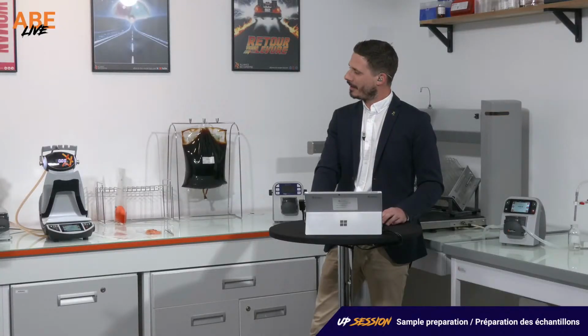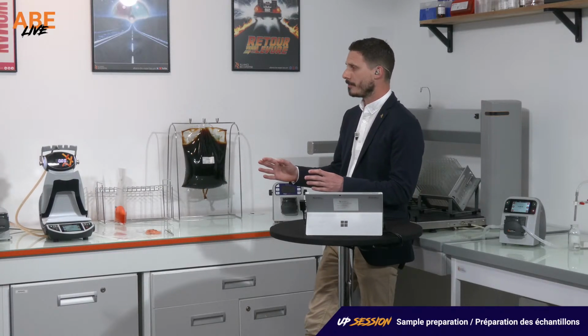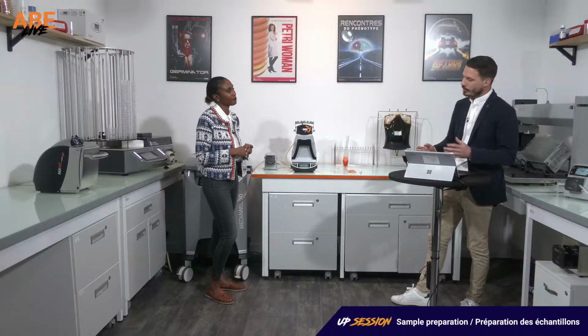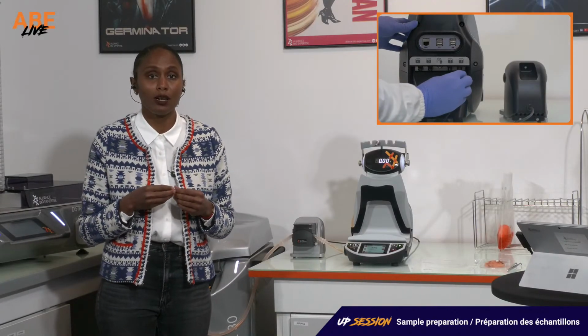Great. So here you use Fraser media. Mm-hmm. What do I do if I have several media to use? So if you have several media to use, on the DILUWEL, you have 4 different ports to plug 4 different pumps. So you can actually use 4 different media at the same time.